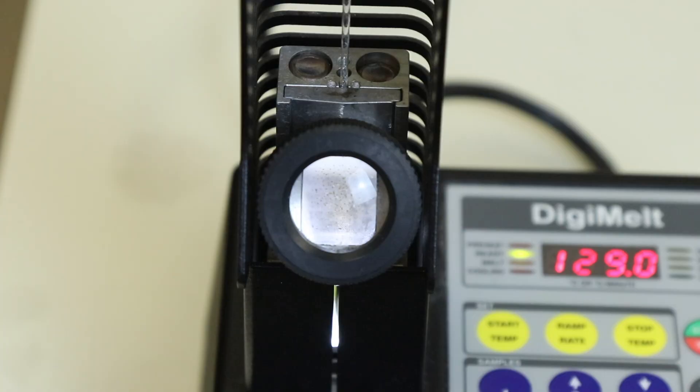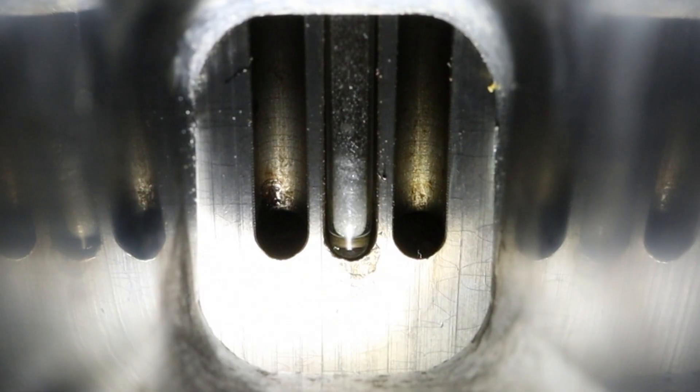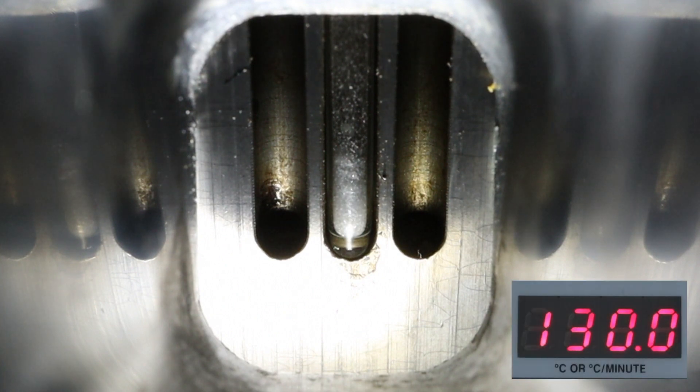Looking through the eyepiece you'll be able to see your product. You're looking for when the solid begins to melt — when you start to see liquid droplets. You won't record a single specific melting point because not all of the solid melts simultaneously. You'll record the temperature when the crystals begin melting and then the temperature when they're fully melted, giving you your melting point range.